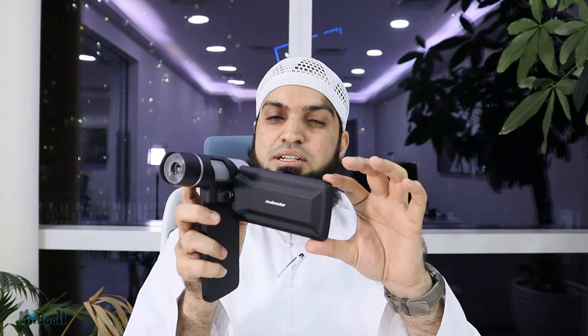The only complaints I have are: one, the focus wheel could have been a little bit easier to roll, because when you're holding it and trying to turn it, it can get a bit shaky — it is very smooth, don't get me wrong, but it could be a little easier to turn. And then the screen is a bit flimsy — it could have been a little sturdier. Other than that, the build is quite good, not very cheap and plasticky. The function and detail settings are great, and the picture and video quality is really impressive in this price bracket. It's a helpful tool to have around and makes a very good present, especially for macro enthusiasts and kids. If you have kids who are looking at screens all day anyway, give them this — might as well learn something from a screen for once. If you want to see something under this microscope, let me know in the comments below — I might make short videos or reels, or even a full video if there are enough comments.